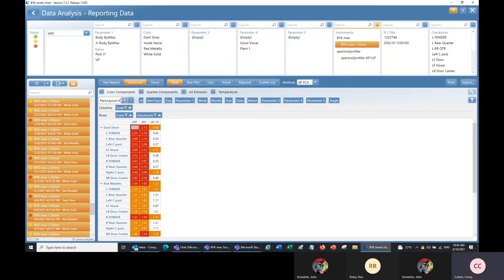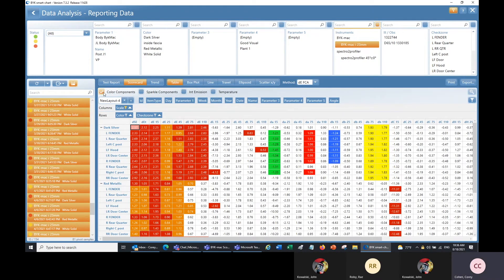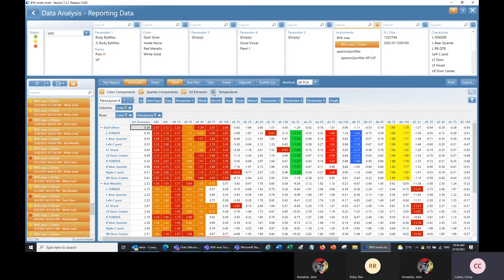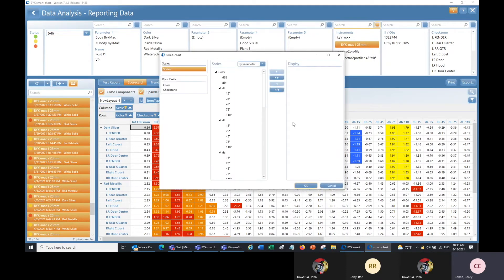You can also check these boxes along the top to add different scales. For example, checking color components shows the L, A, and B values at each angle. You can check sparkle components, the intensity emission value, or the temperature. So you can govern the scales in the pivot chart either by these check boxes at the top or by clicking on scales and selecting them that way.